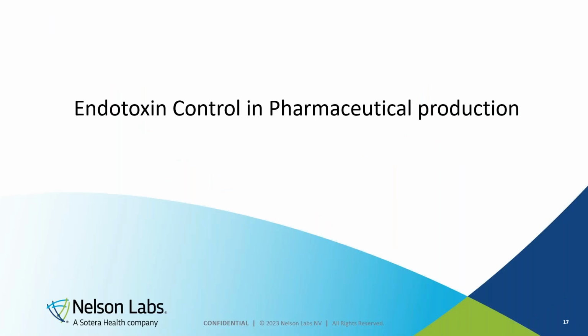Okay, and then the major part of this webinar is the endotoxin control. We're now going to use these principles to perform risk assessment and to look where we can intervene in our production process, what we should control to have a final product that is endotoxin free.